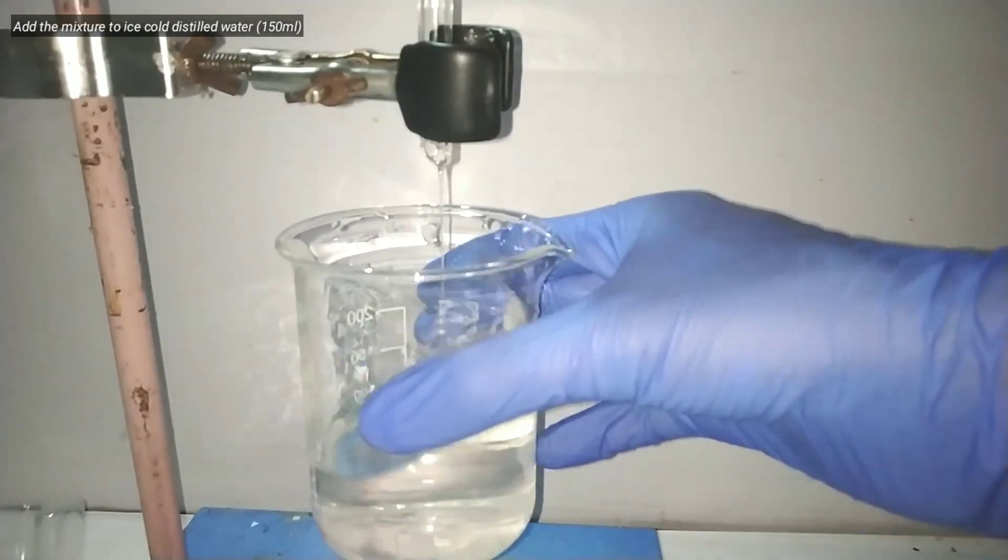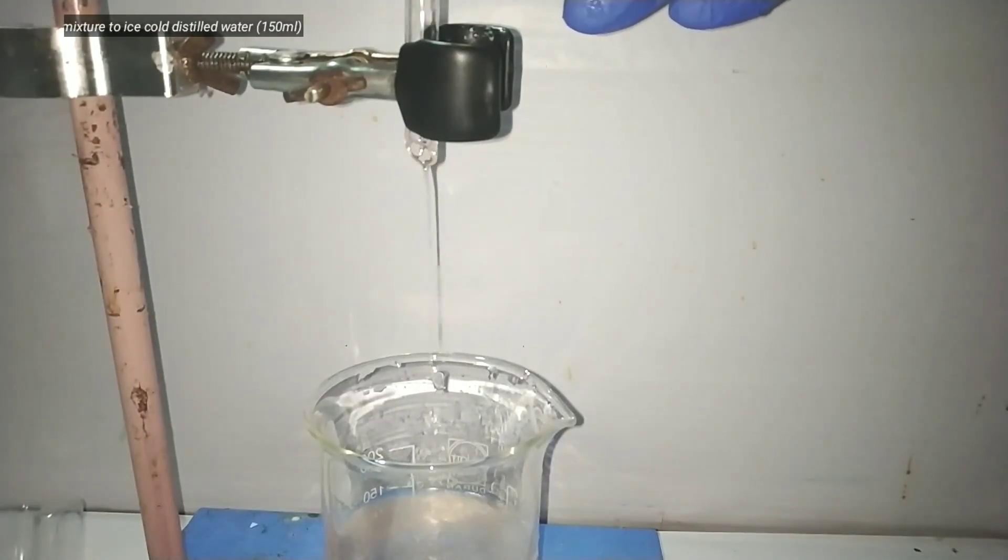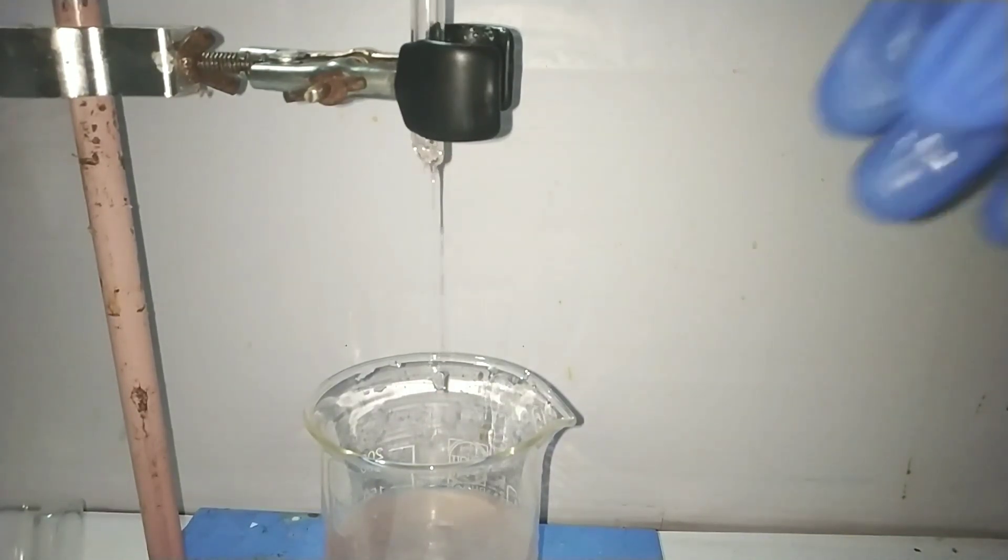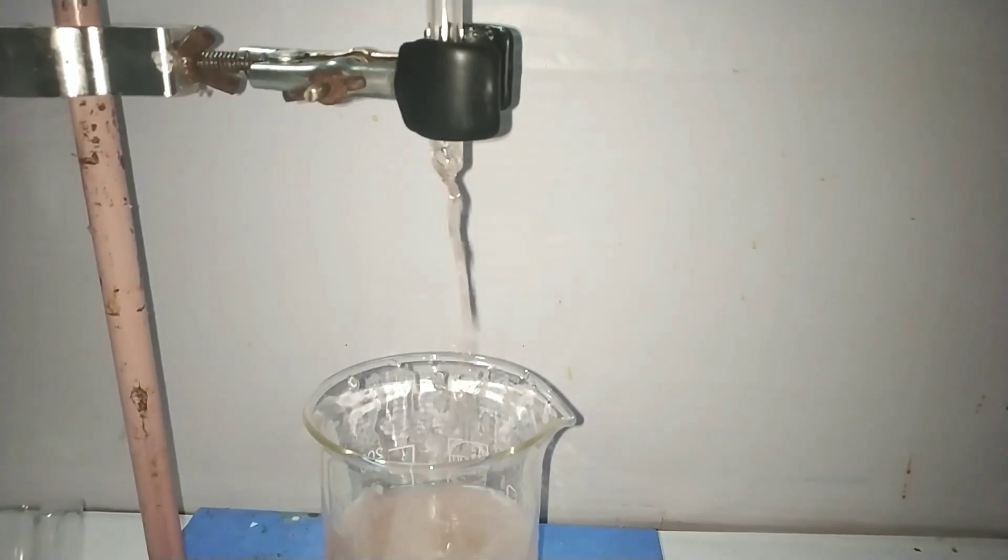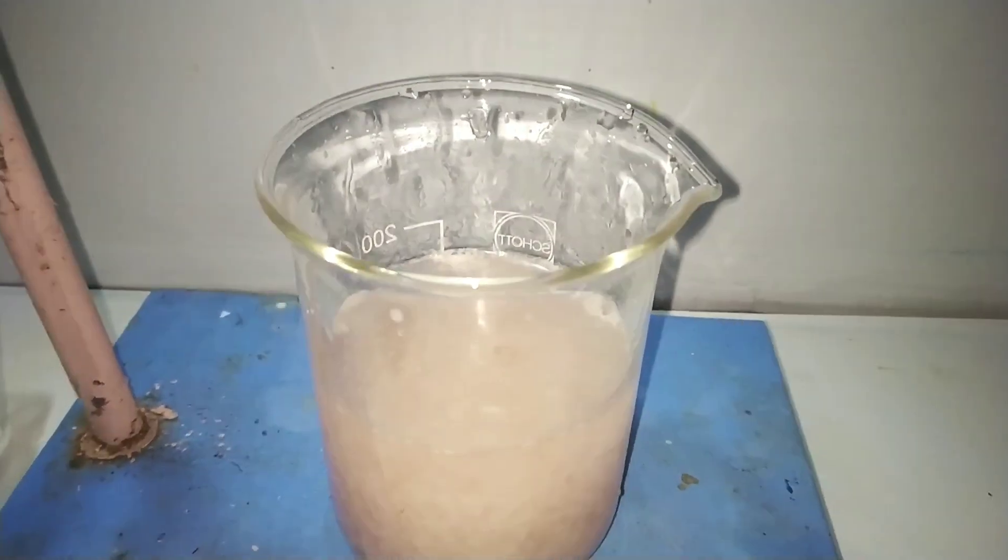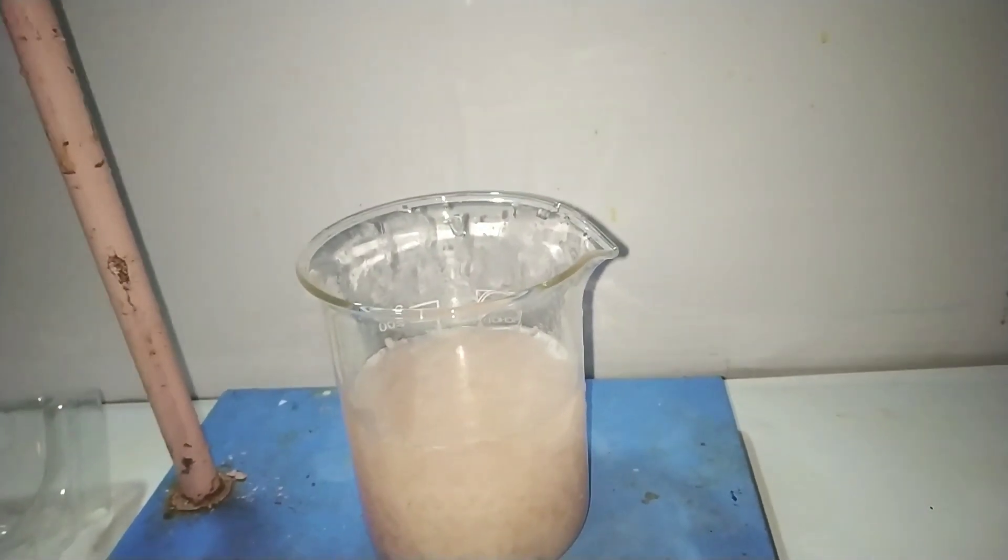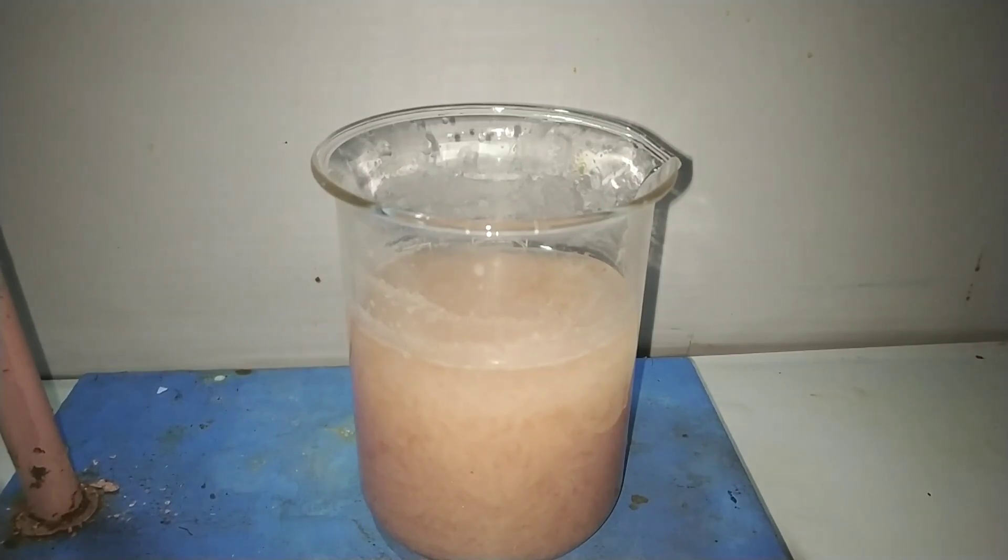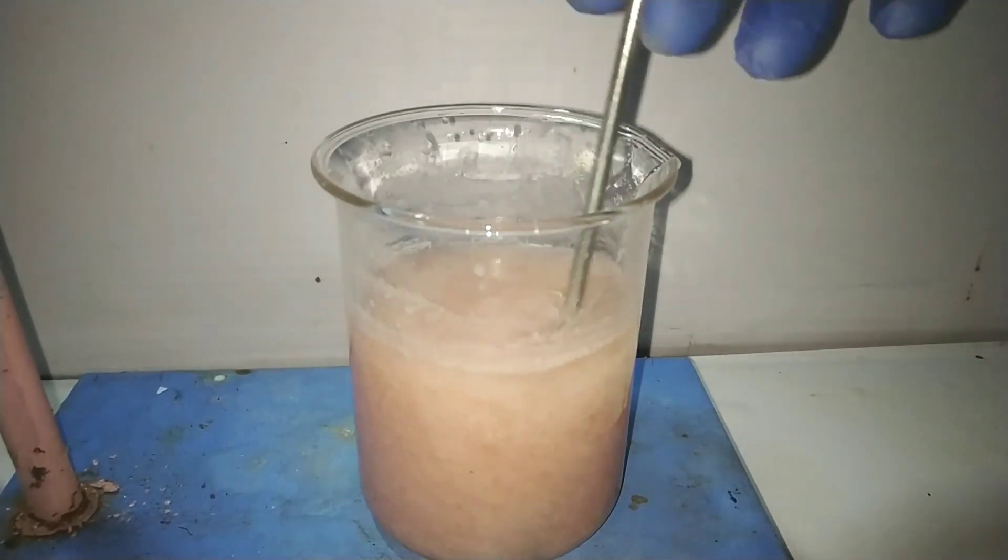So next we take about 150 ml of ice cold distilled water and add the contents of the flask into the water. I forgot why but I had taken the contents of the flask in my separatory funnel and then added it into the distilled water. On mixing them together a white precipitate separates out and this is the crude parabromoacetanilide.